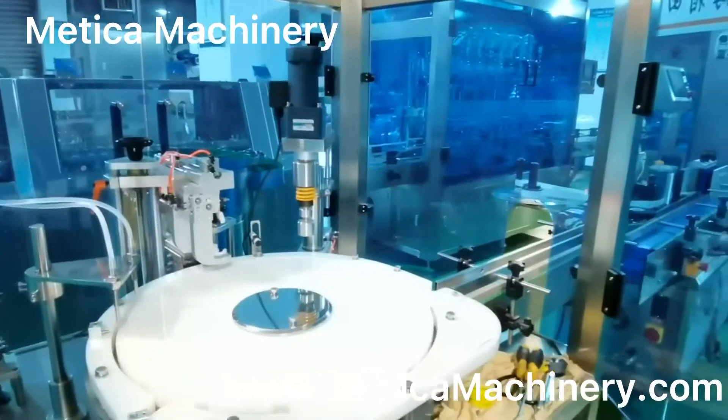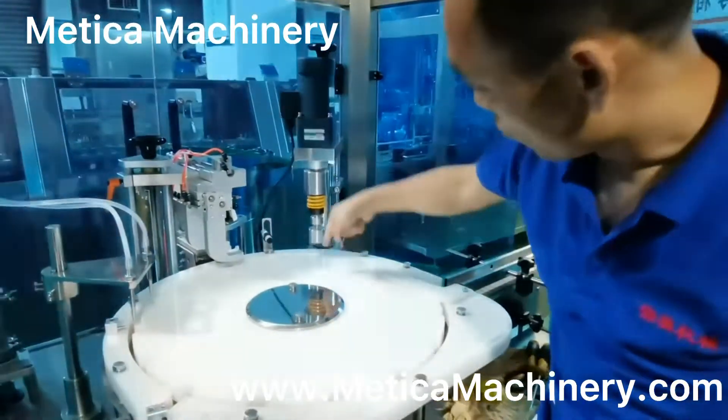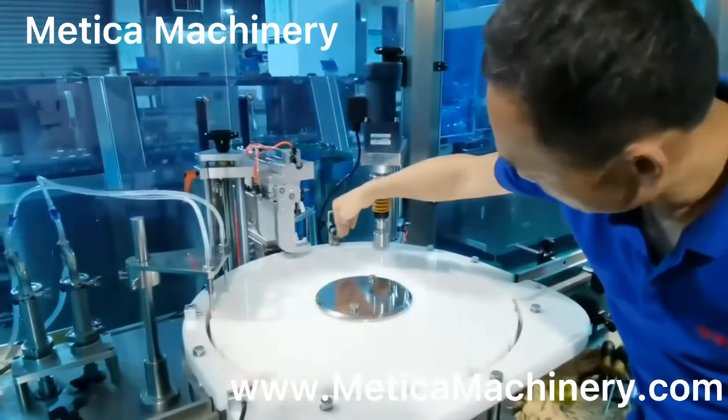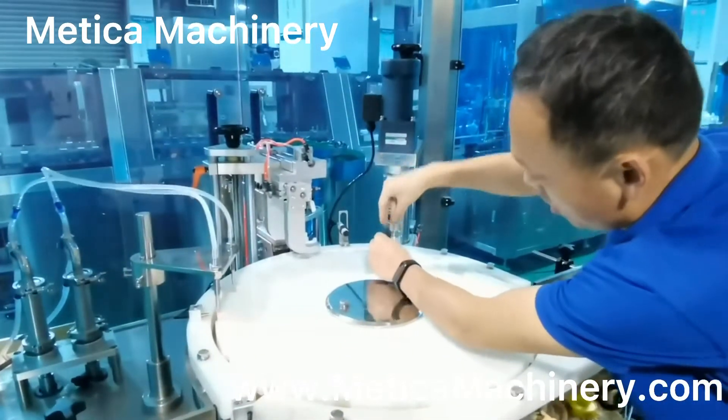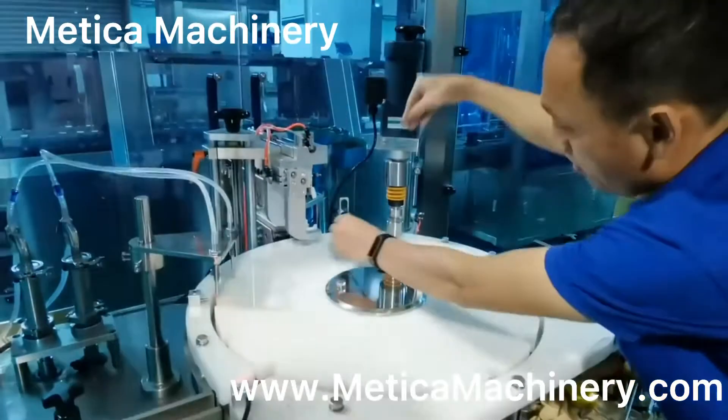So when we check the bottle — when the bottle comes in and the capping head comes in, it should reach here at exactly the right time.